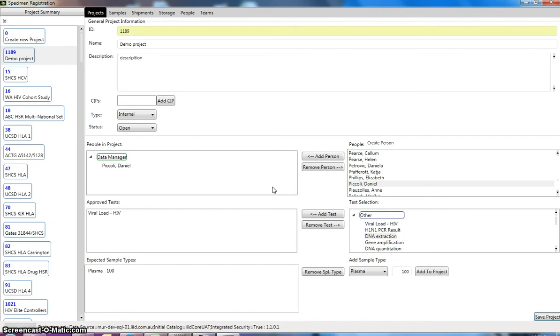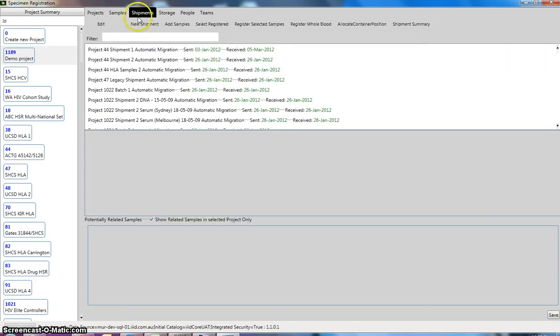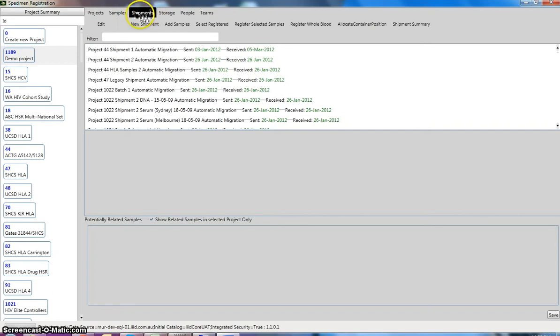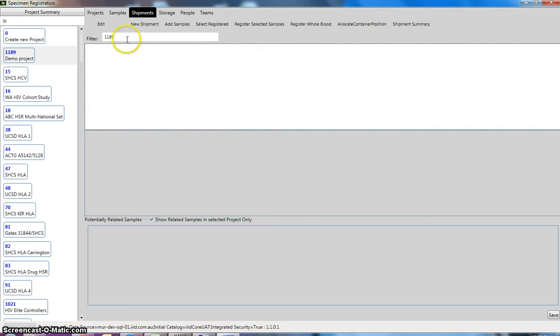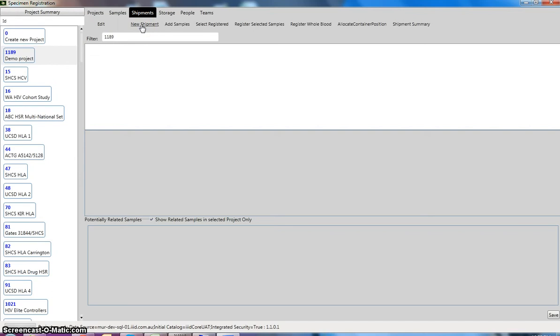We are able to actually assign samples to our project. And usually samples come in through shipments. So we click on our shipments tab at the top of the application. And so when we get our list of shipments here for all projects. But if you want to filter the list of shipments, you can. So as you can see at the moment, we don't have any shipments with the name 1189 in the title. So we can create a new shipment for this project.